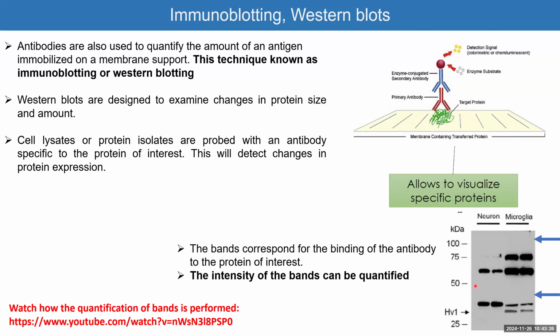So what you need to do is to quantify the bands. You quantify the intensity of these bands in order to say, oh, this is like probably 30% compared to this protein. Now, how you do that, this is a whole different story. This is very easily done.